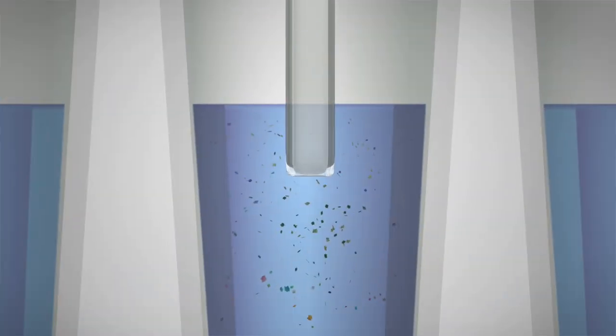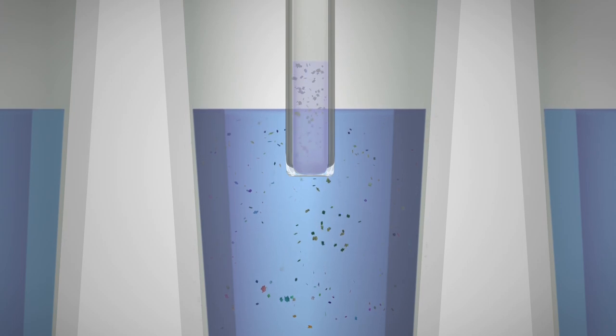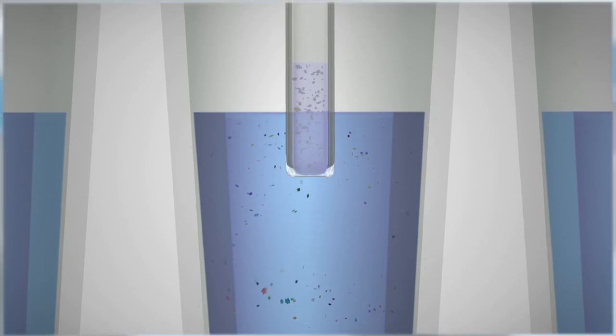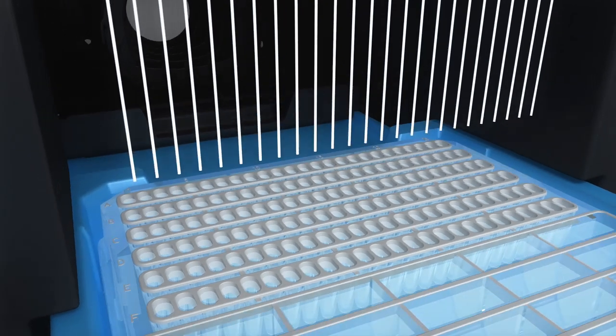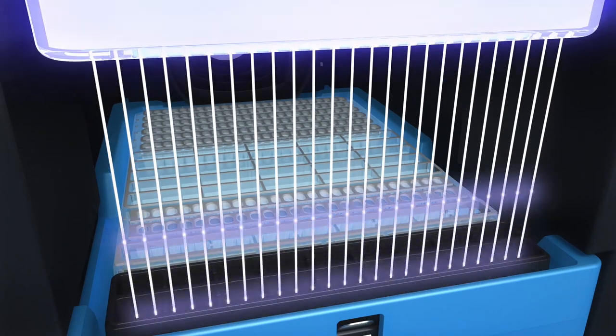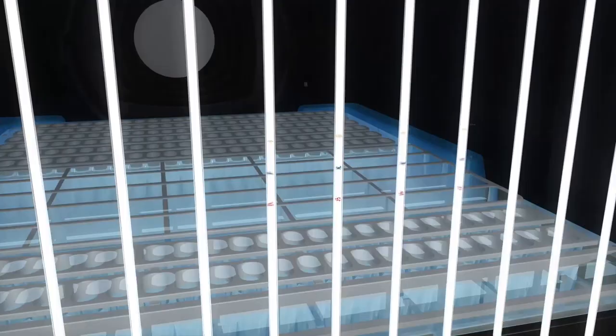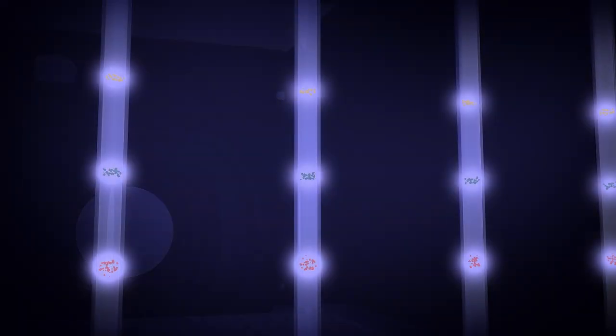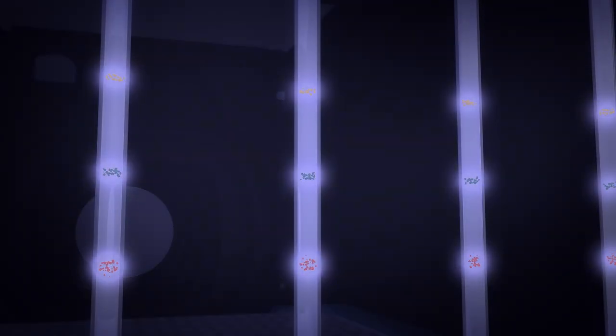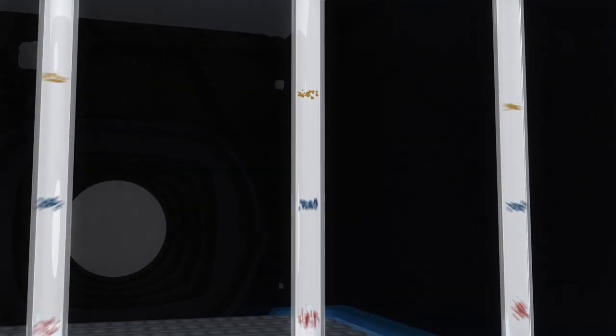Next, your protein lysate is loaded and capillaries are lowered to make contact with running buffer. Voltage is applied to enable separation by molecular weight. Once the separation is complete, UV light immobilizes the proteins to the capillary wall. With proteins now immobilized and the matrix cleared of the capillary, Jess starts the immunoprobing process.